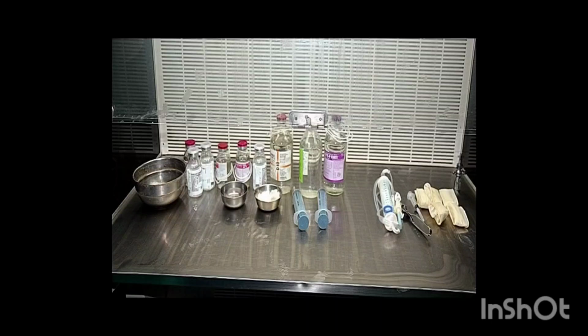Total parenteral nutrition may be defined as provision of nutrition for metabolic requirements and growth through the parenteral route. To maximize benefits and minimize complications, many centers across the world now prepare the total parenteral nutrition through a centralized pharmacy. However, in the Indian situation, it is the physician who has to take over the roles of this preparation. Total parenteral nutrition is technically demanding, it is expensive, and has got several side effects.